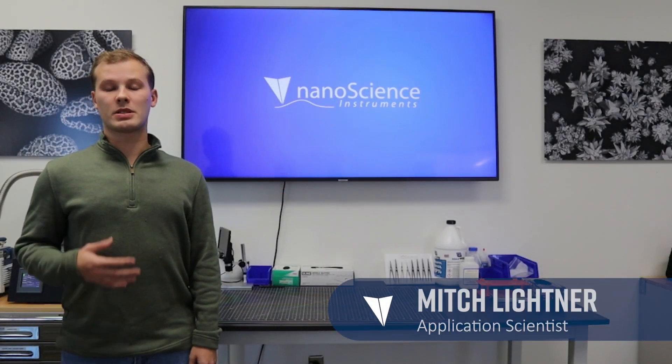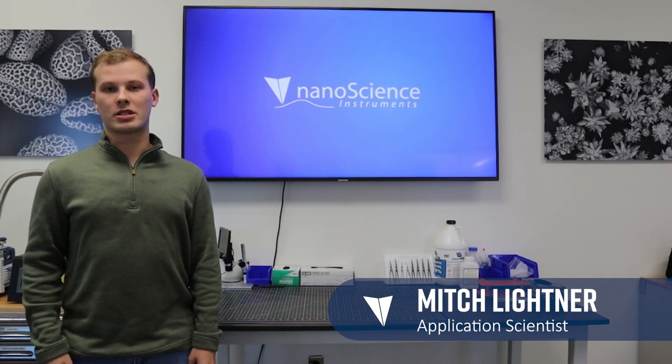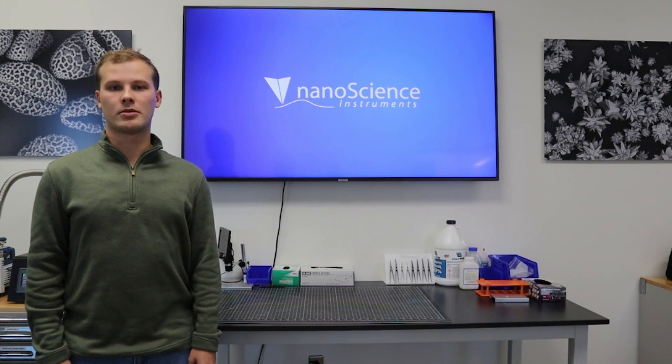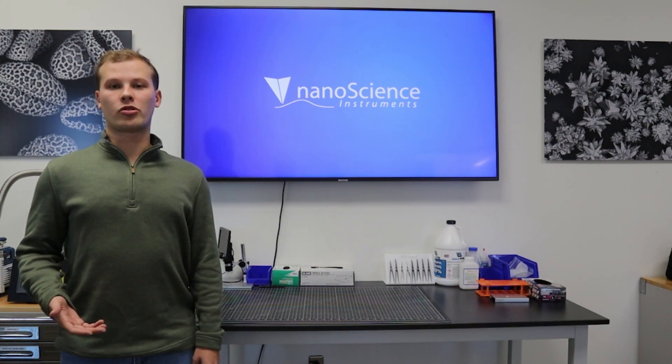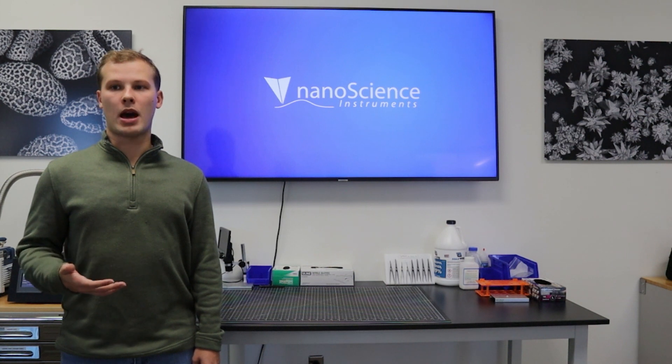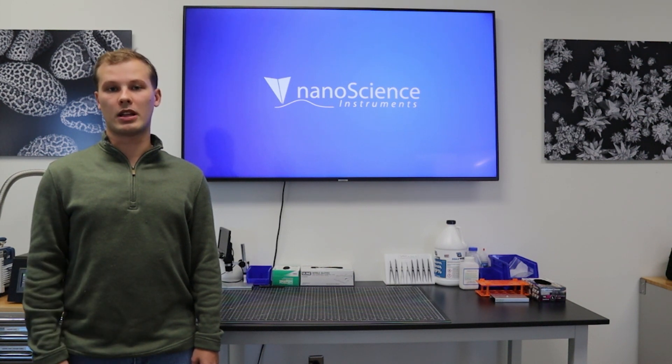Hi everyone, my name is Mitch Leitner and I am an Application Scientist with Nanoscience Instruments. Today I will be demonstrating how to properly prepare dry powder samples for analysis with the Phenom SEM.